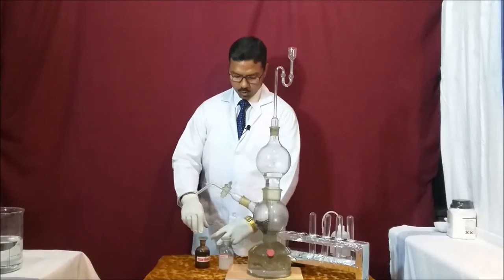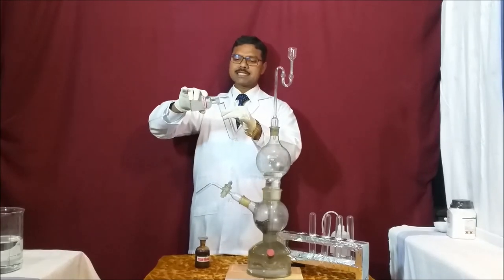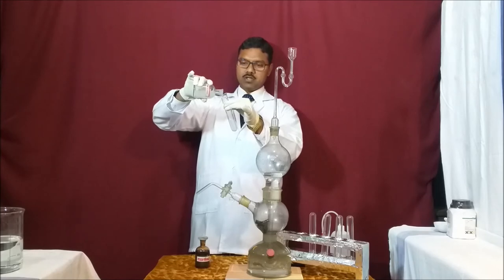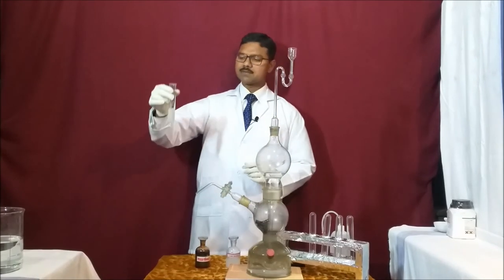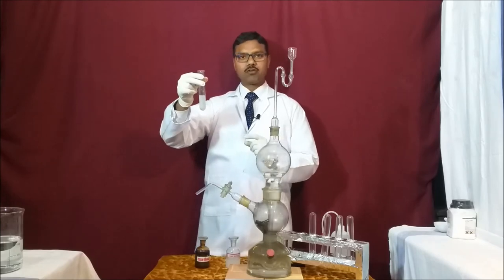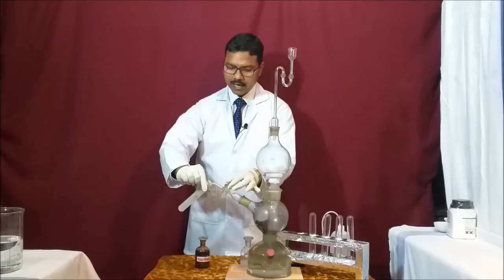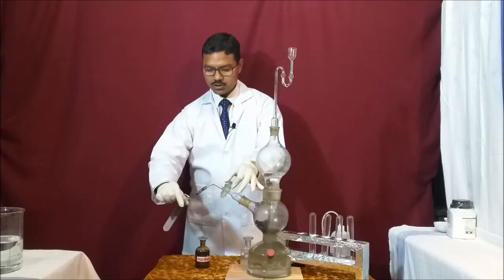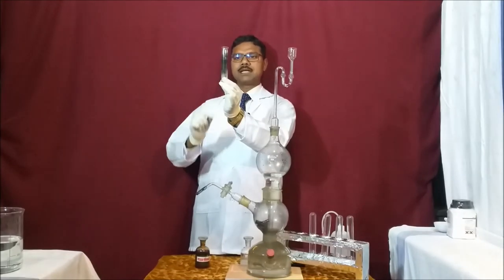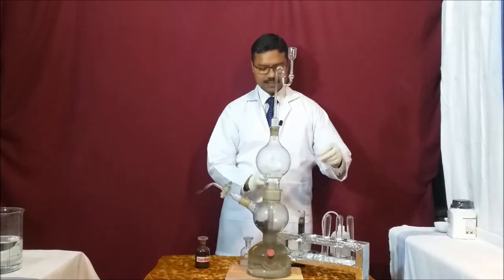For the identification of H₂S gas we perform two tests. First, the test with lead acetate — we know H₂S gas turns lead acetate solution black or silvery black because of the formation of lead sulfide. I am introducing this gas into the lead acetate solution — opening the knob very gently and slowly. As soon as the gas comes in, you can see the lead acetate solution turns black. This black color is of lead sulfide, confirming the identification of H₂S gas.